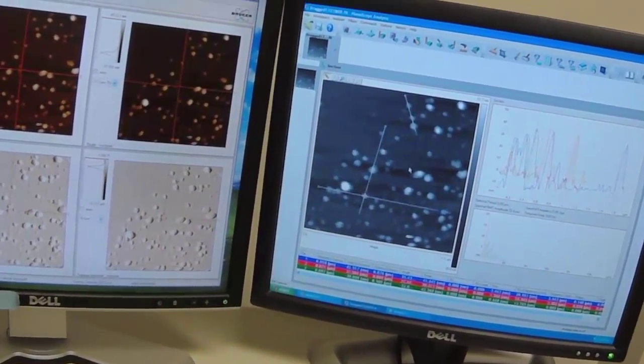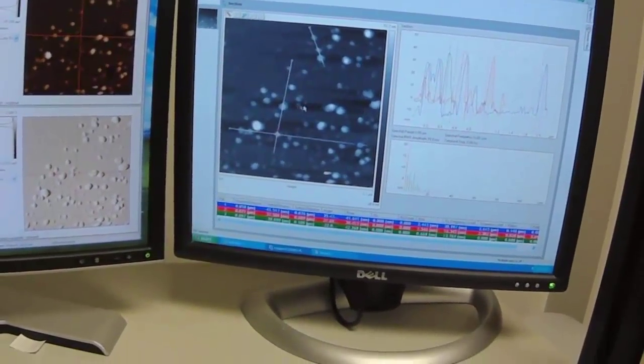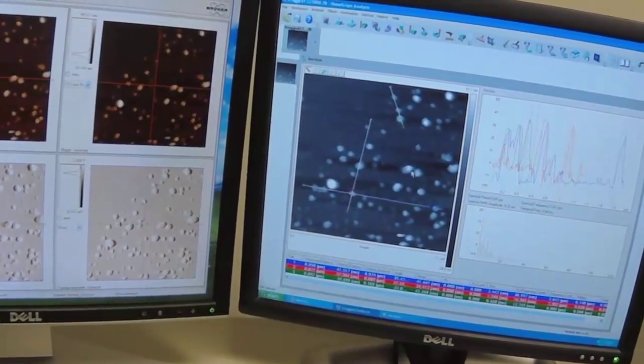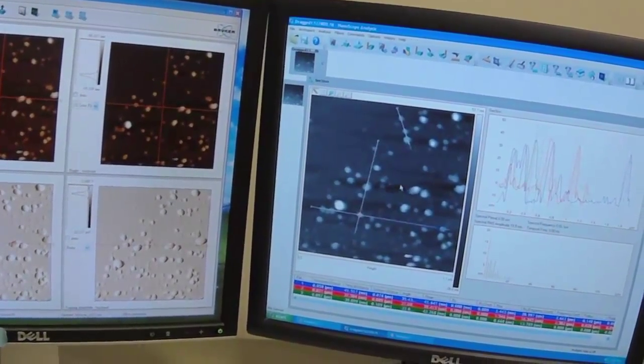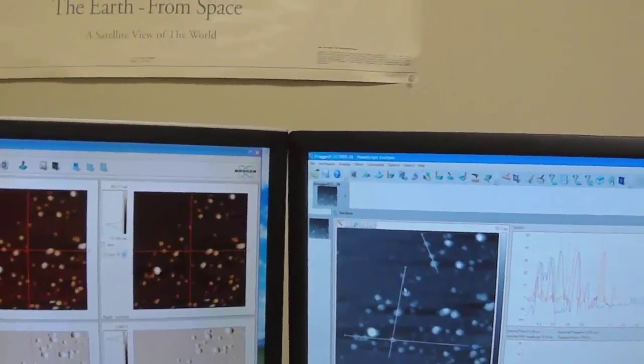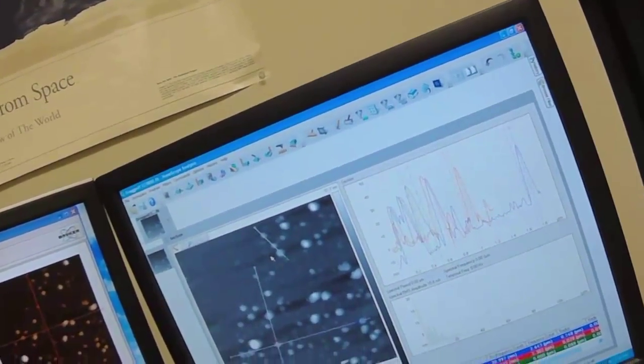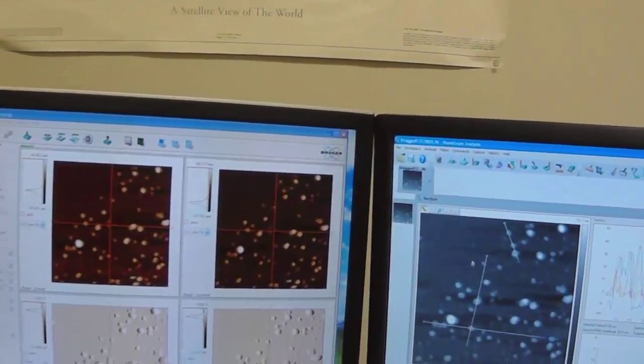So that's how to measure your nanoparticle size. Note height and width. Make a data table. Measure as many as you can. It helps to look at separate particles. And then in your report, you can do a particle size distribution graph, average, deviation, and why is height a different value than width even though we are looking at spheres.